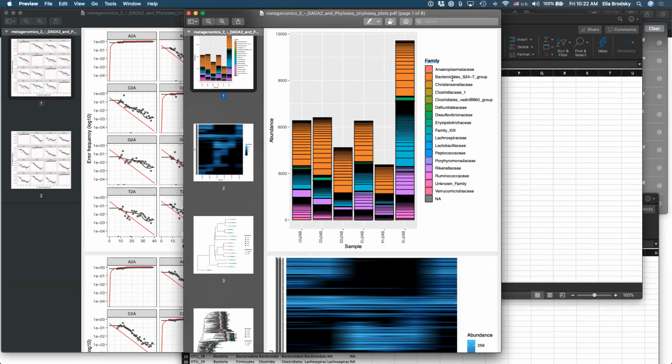For example, I could combine fecal, cecal, and then chow and high fat diet, right? And if cecal and fecal have the same story, what would the story be? For example, the diversity changes, or some representative is much more pronounced. That would be better information for me to make conclusions about how the microbiota changes affected these mice. What kind of stable condition did it create?